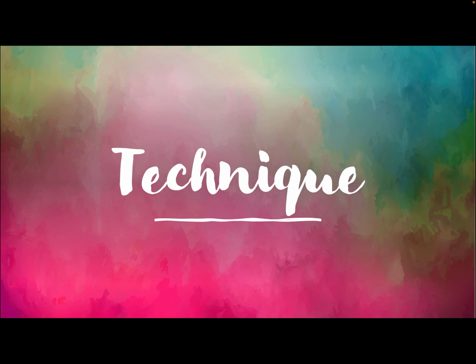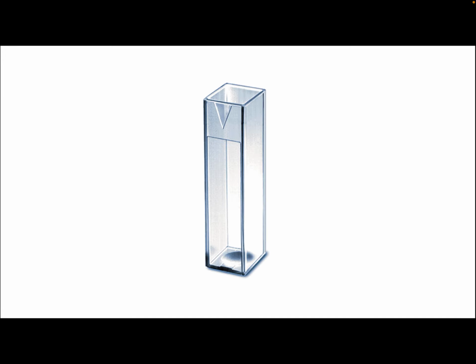Now we're going to go into the technique part of the presentation, which I animated. So first you're going to create your samples in the cuvettes. You're going to fill the sample to the top using a pipette. Only to the top line, not past it.